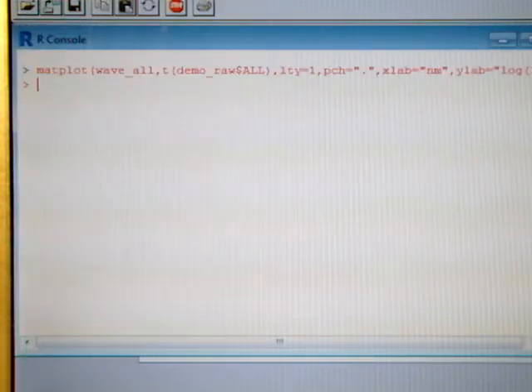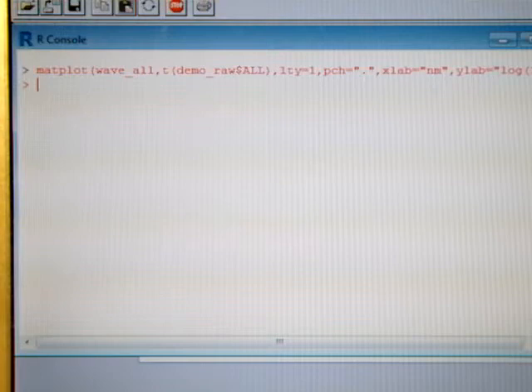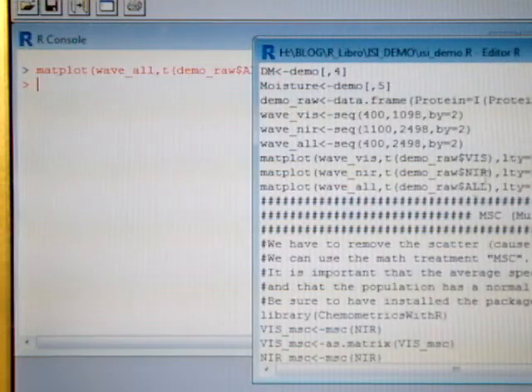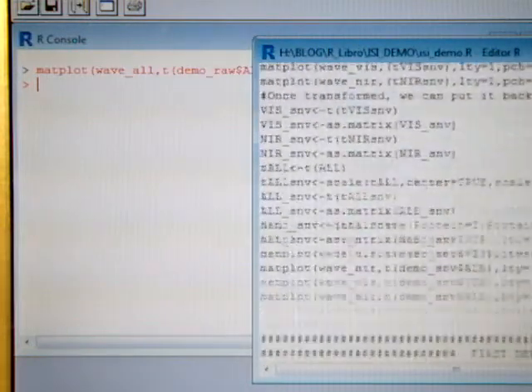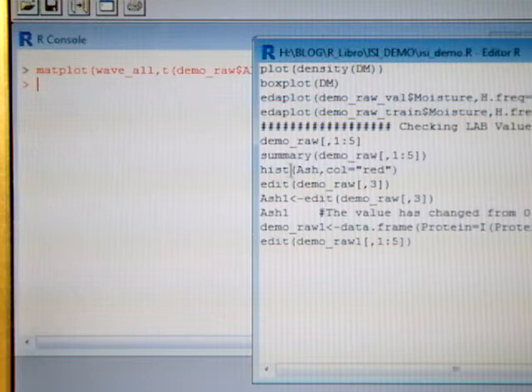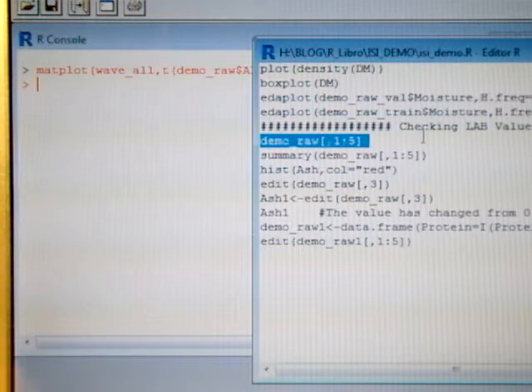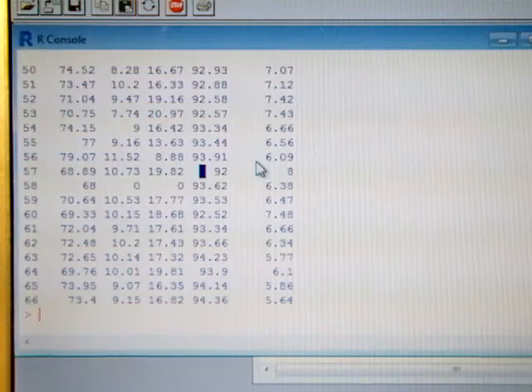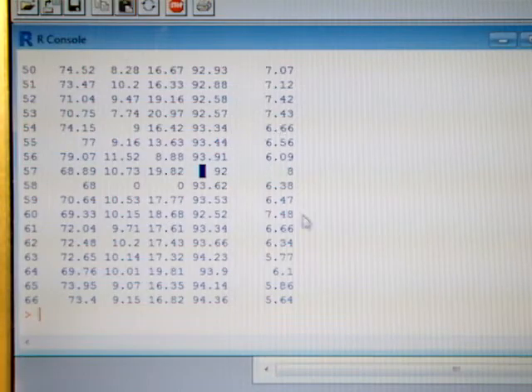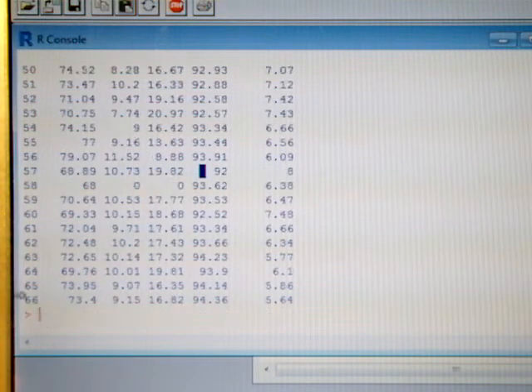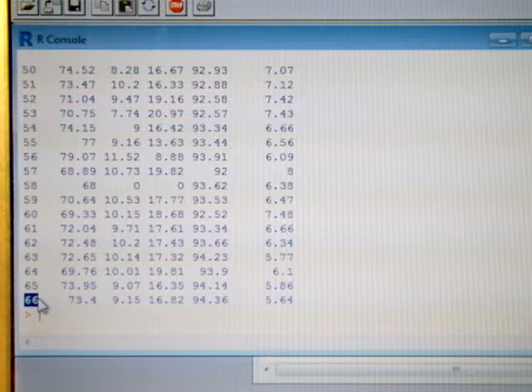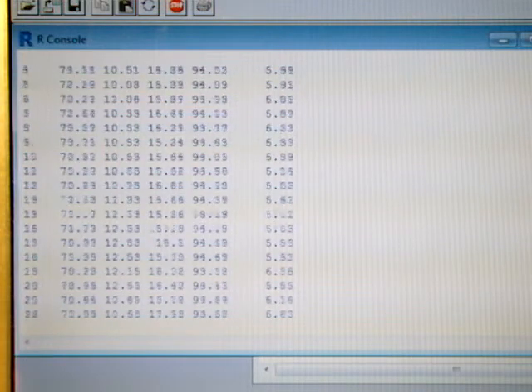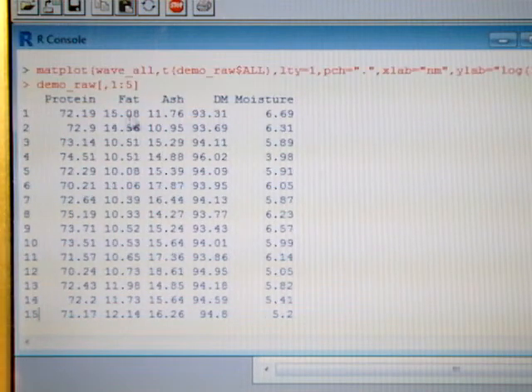So we are going to check the reference data, and the reference data is in the first 5 columns. If we have a look we see that we have 66 samples and 5 constituents.